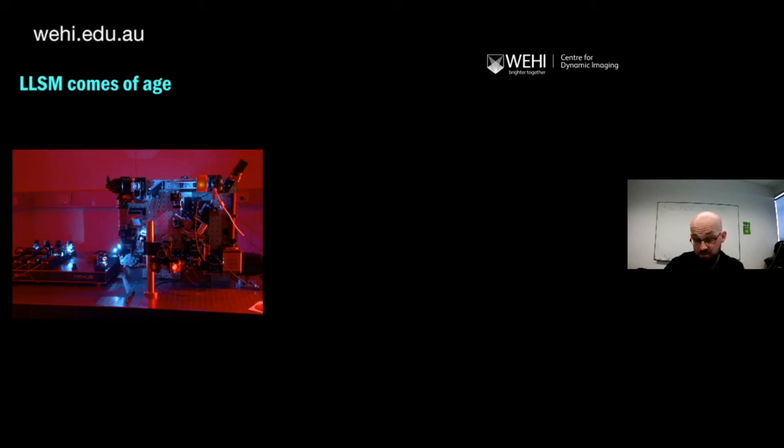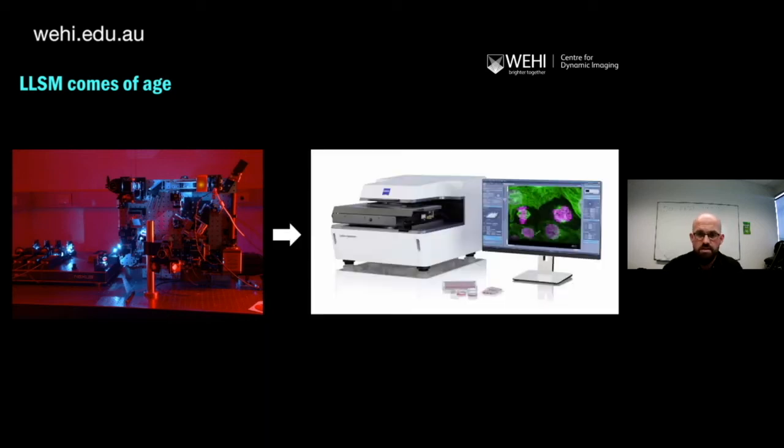And so what Zeiss eventually came up with was they turned this absolutely magnificent machine into this microscope. It's definitely a microscope. It does resemble a sandwich press or a photocopier. And the first thing I noticed is that it's quite visually unremarkable. But what Zeiss have managed to do under that unassuming cover is quite impressive.